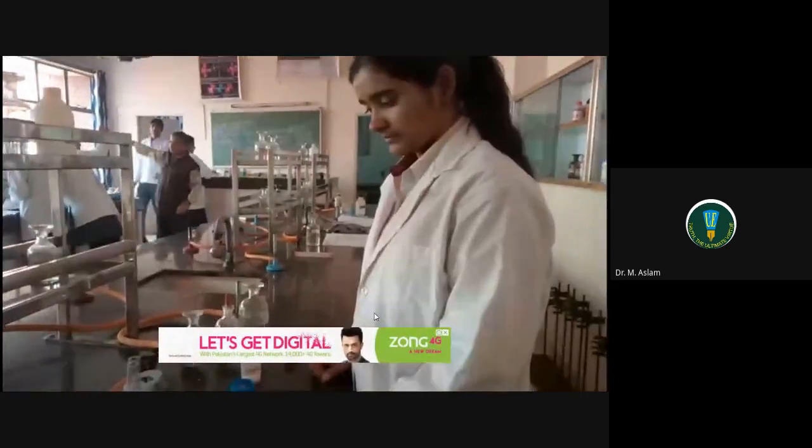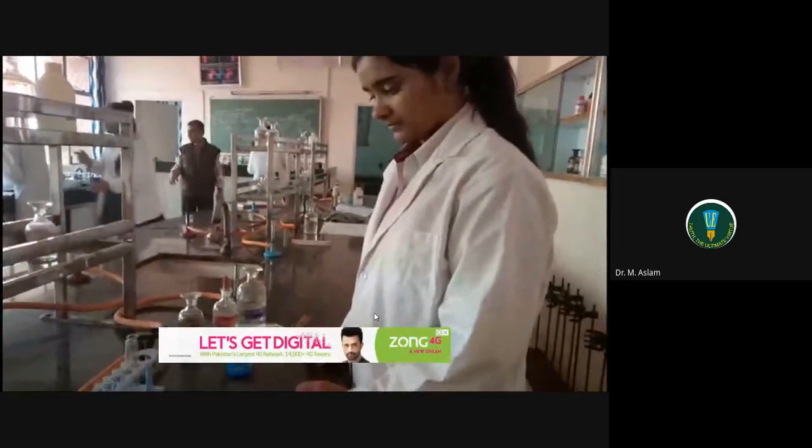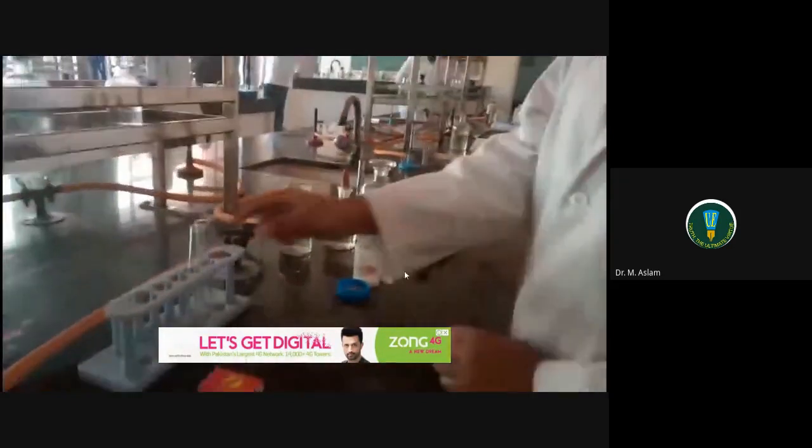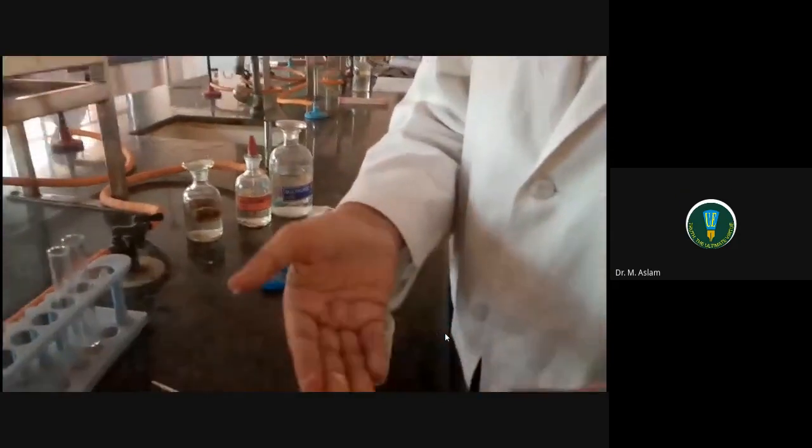We are detecting the nitrate ion, and the procedure will be done by one of my students, Namita Jalal. She begins with her salt. Let's have a look at the salt first. The salt is not like a face powder, you can feel it in your fingers to check. It could be like sugar, could be like salt, but it definitely is not like face powder.